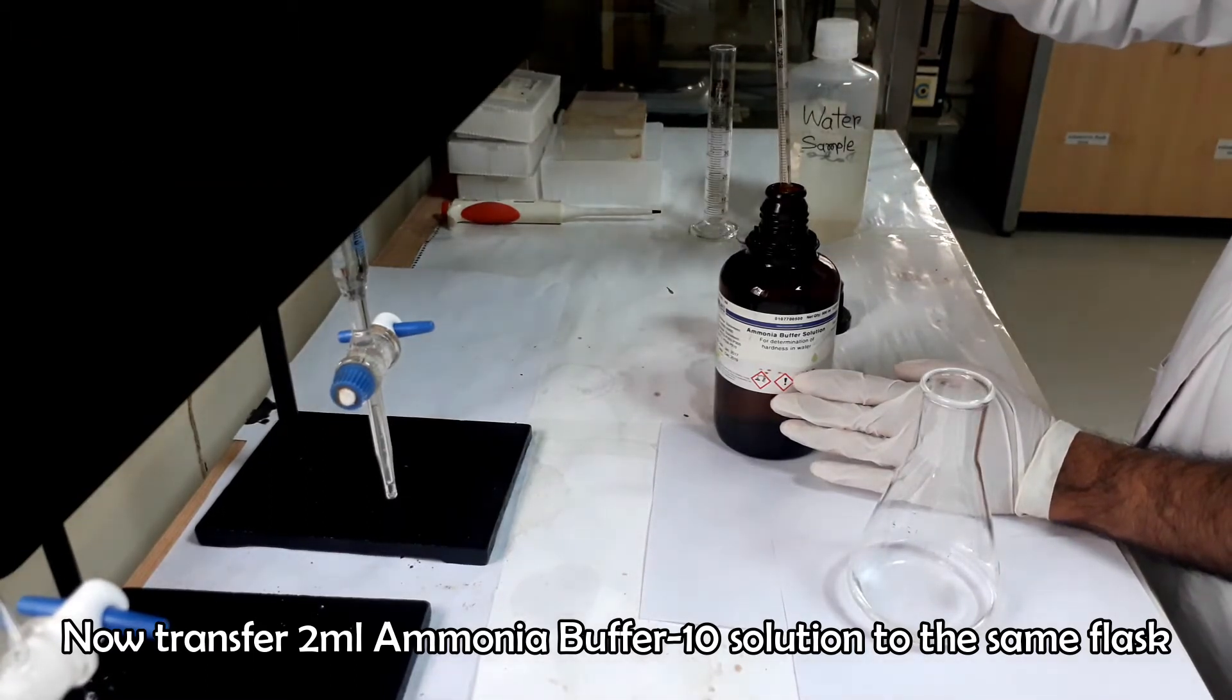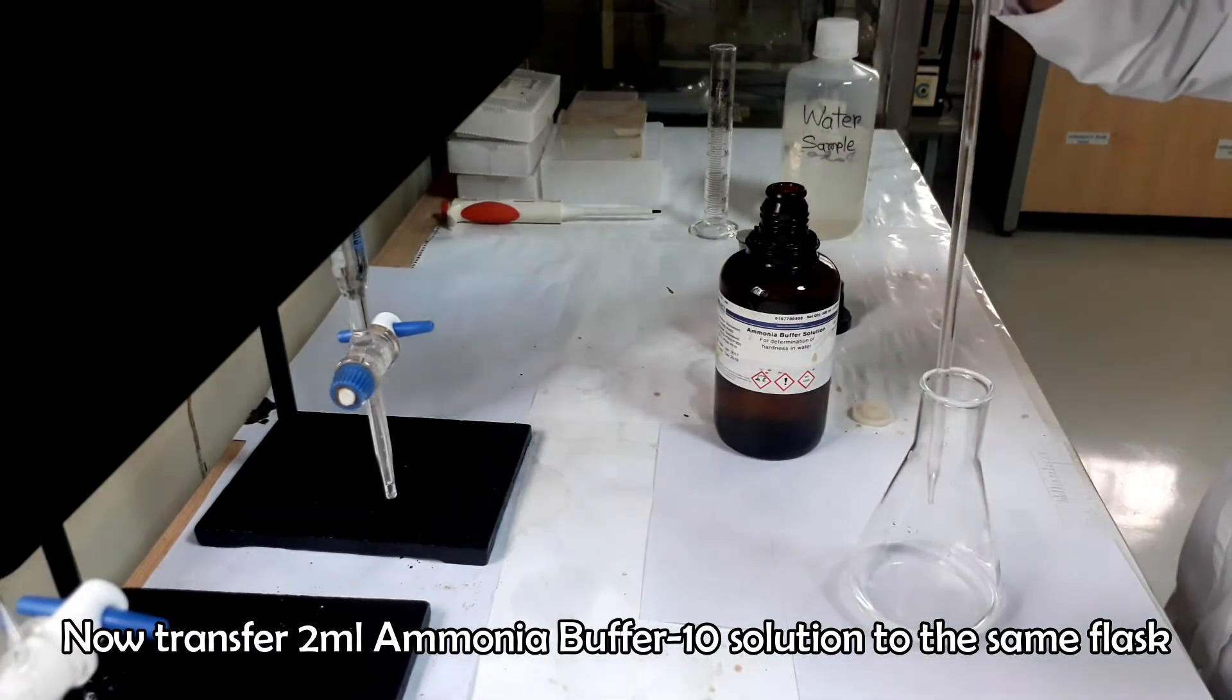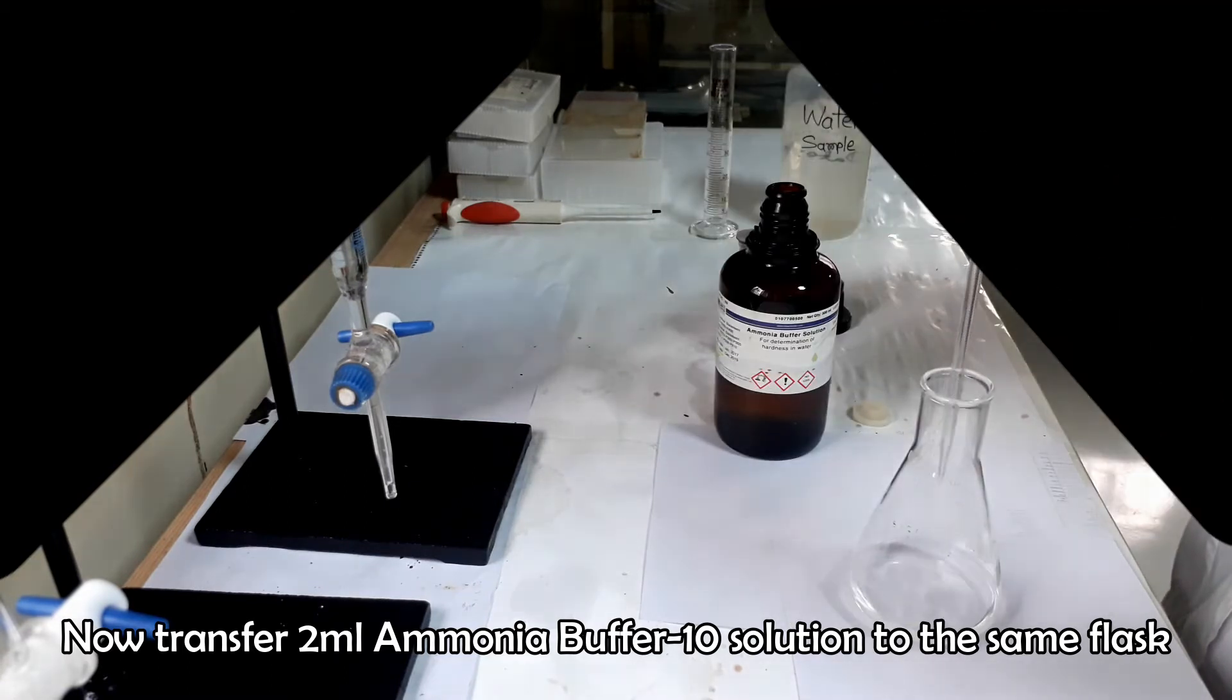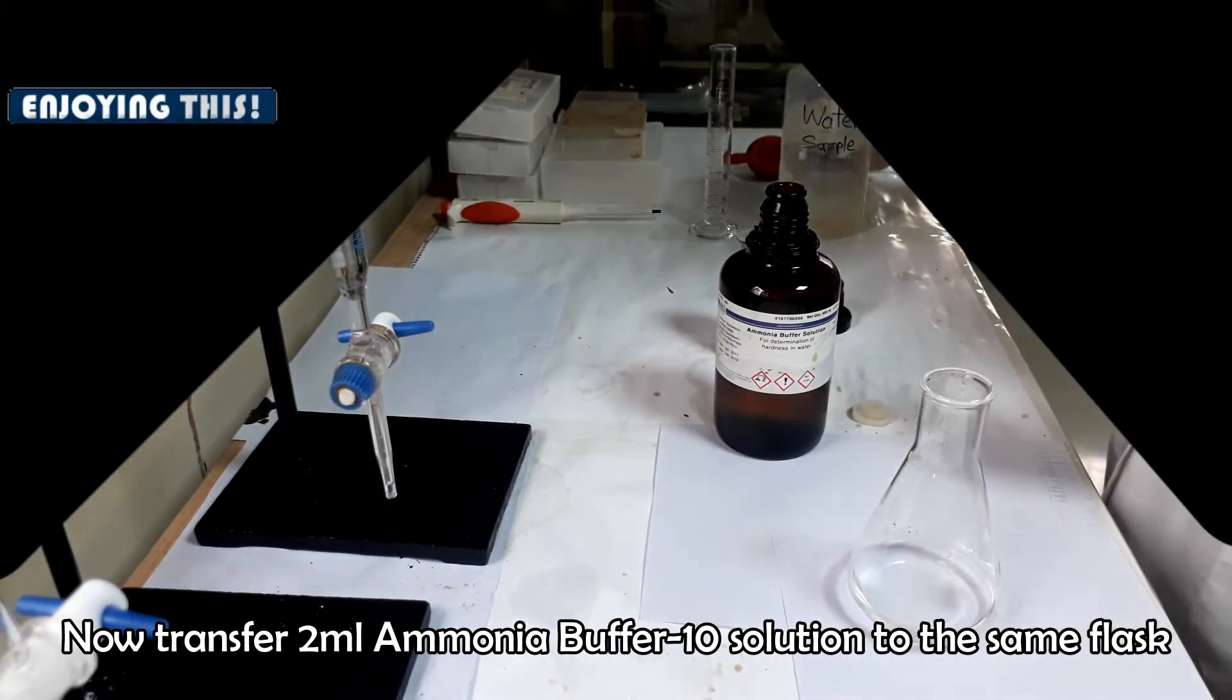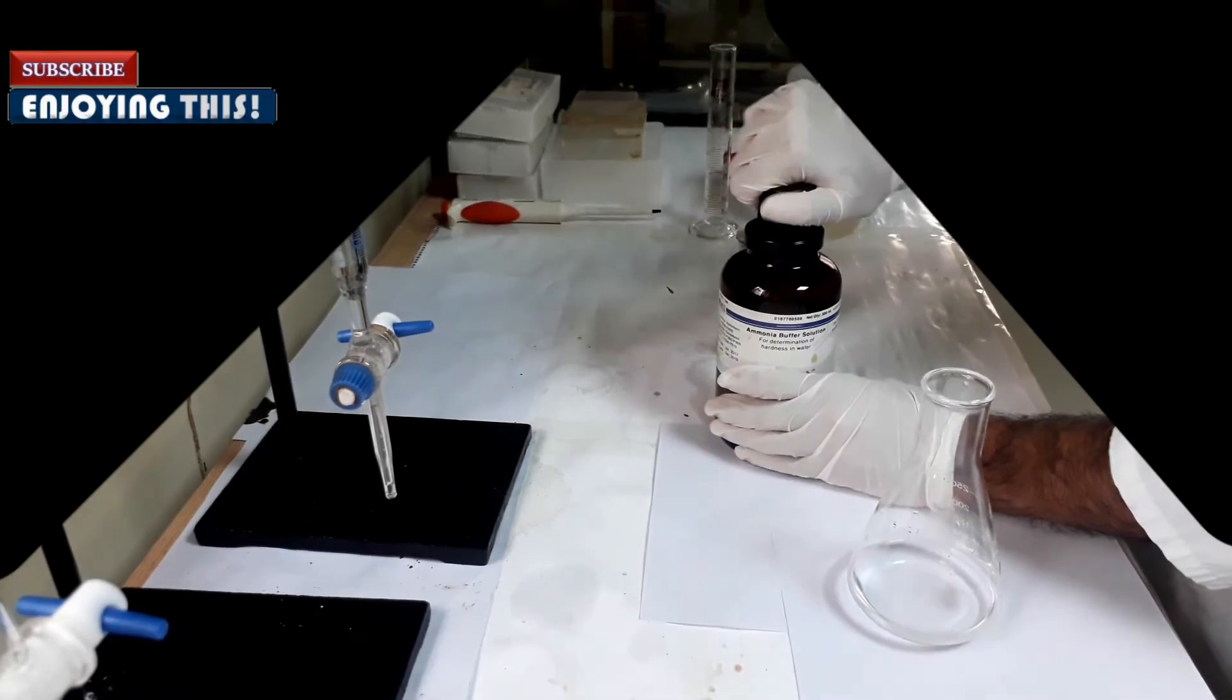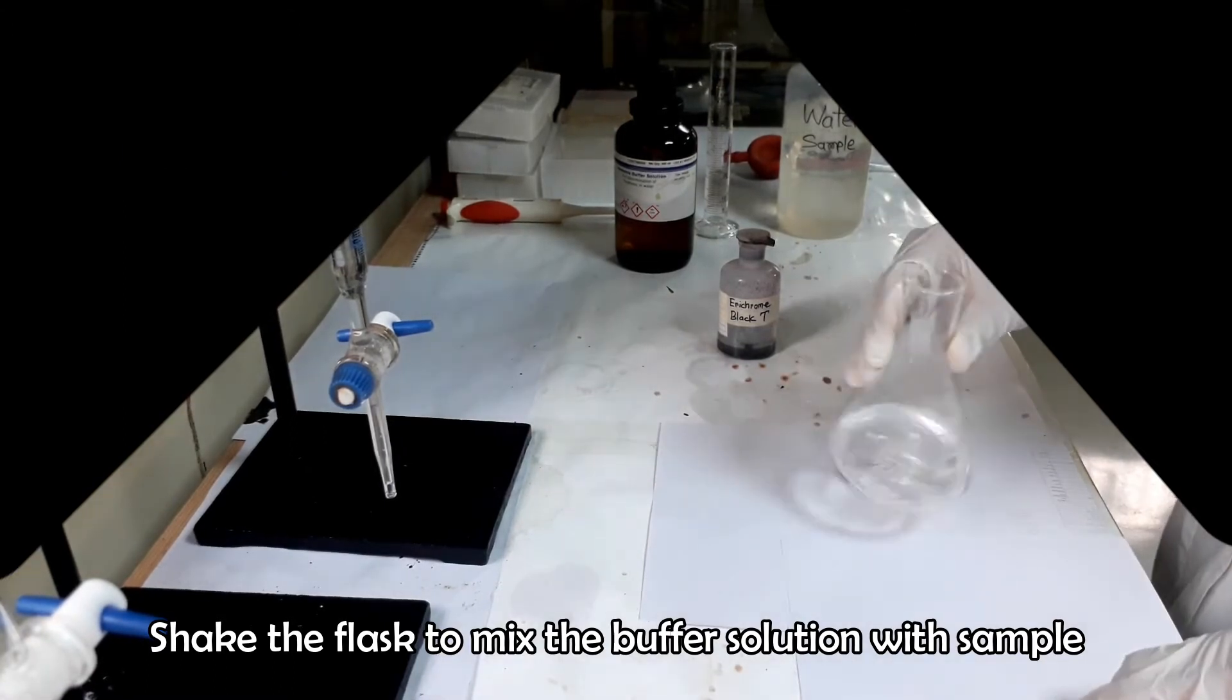Add 2 ml of ammonia buffer tense solution. Rotate the flask to mix the water sample with ammonia buffer solution.